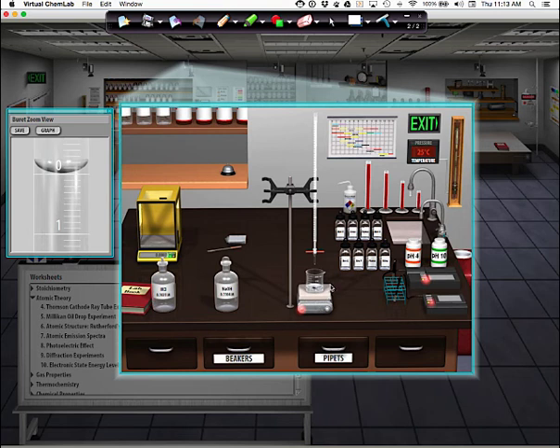Then, guys, this is another glitch in the software. The next step, which one are we on, 15? You want to put a star next to number 15. Don't forget number 15 or you're going to get in trouble. Guys, number 15 says this, put phenolphthalein indicator into the beaker. Now, guys, over here on the right, these are all your indicators. This one right here is the phenolphthalein.